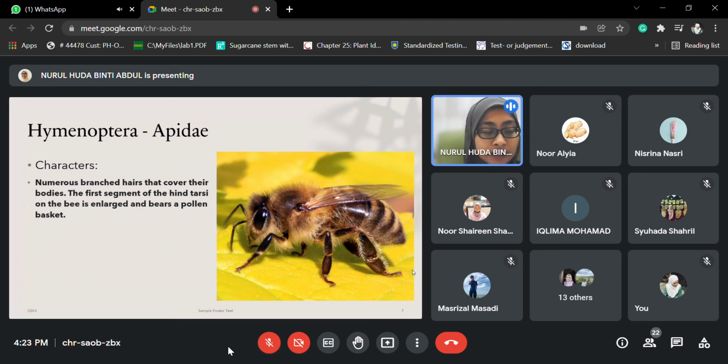Now they have, especially workers, it doesn't have ovipositors, the one yang dia guna untuk lay eggs. Okay, so now dia punya ovipositors atau dia punya abdomen is modified. At the end of the abdomen ada segmen yang dimodify menjadi sting. Kan? So tu juga is the characteristic for the RPJ. Okay, you can use that as well.